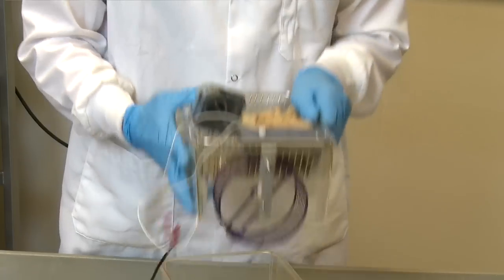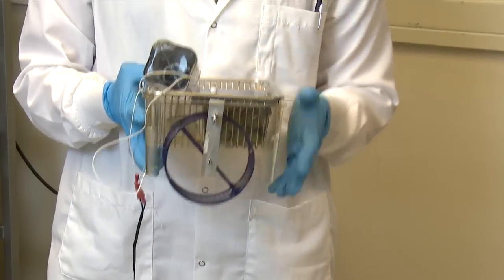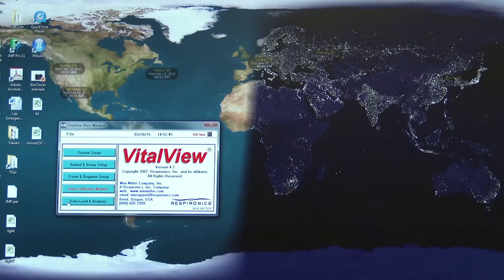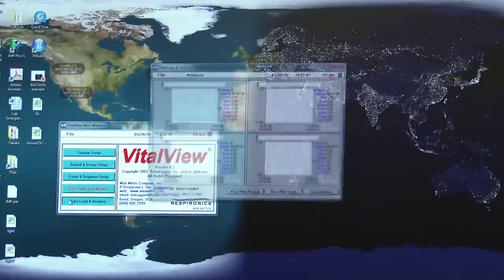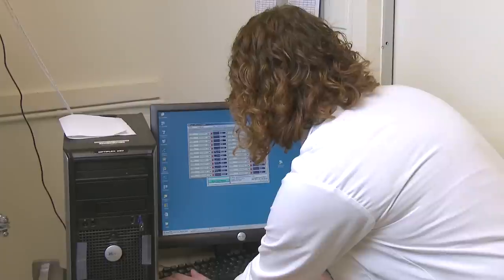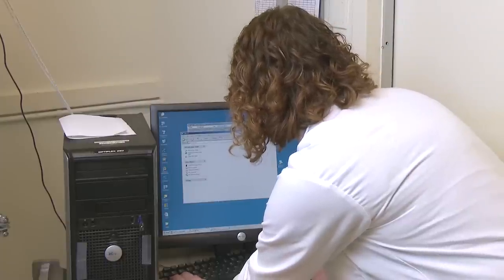The sensor placed above the wheel can detect the passing of the magnets as the wheel revolves. Information is collected through the sensors using a program called VitalView, which monitors wheel running and, depending on the experiment, other types of measurements from many different animals. All the incoming data is logged by the data collection computer.